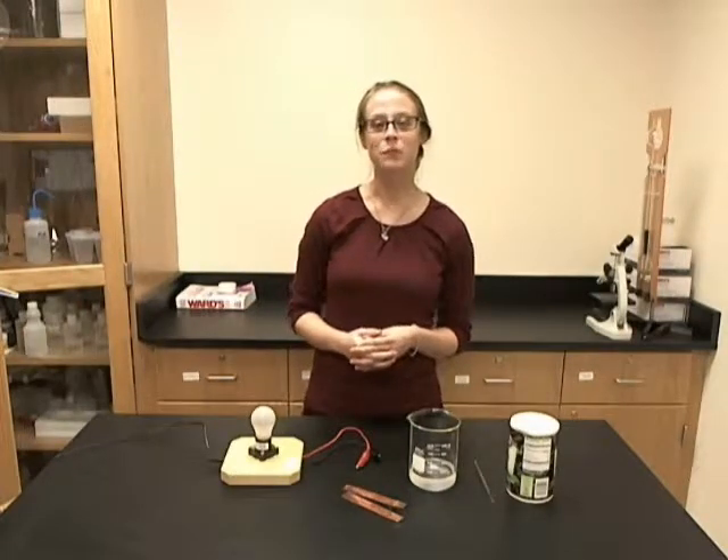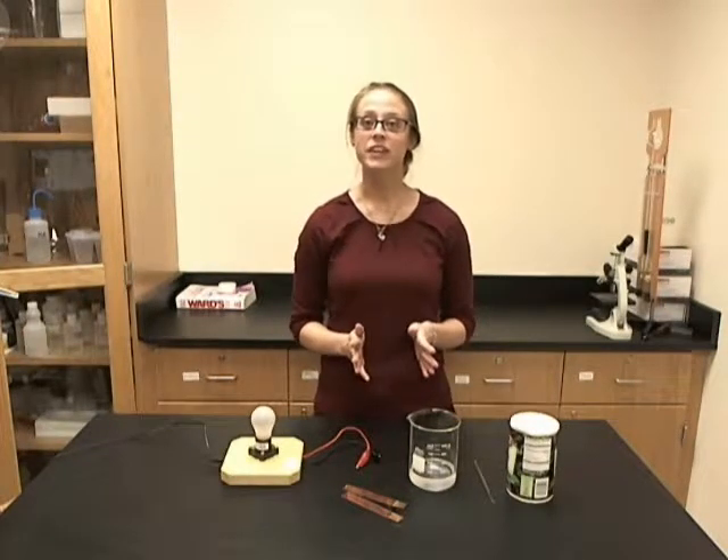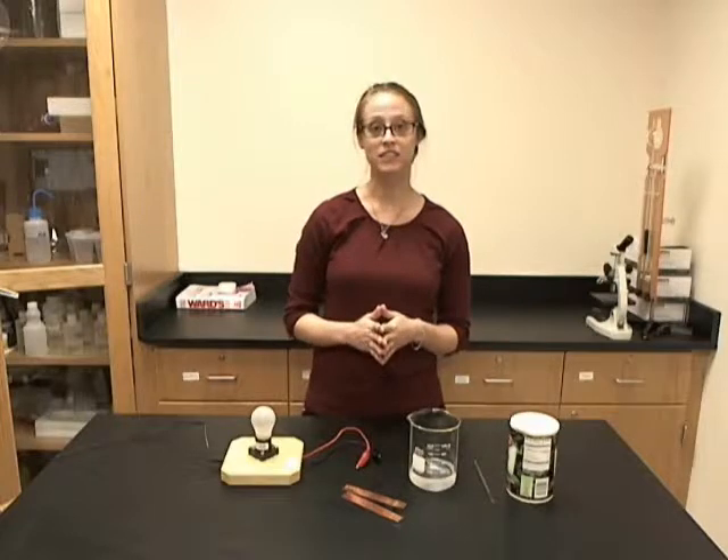Hi, I'm Teresa from Wards Science, and in this video I will be showing you how to test for conductivity.